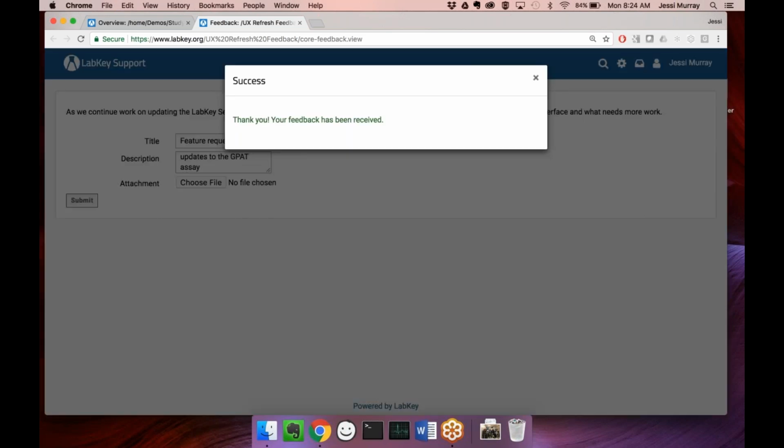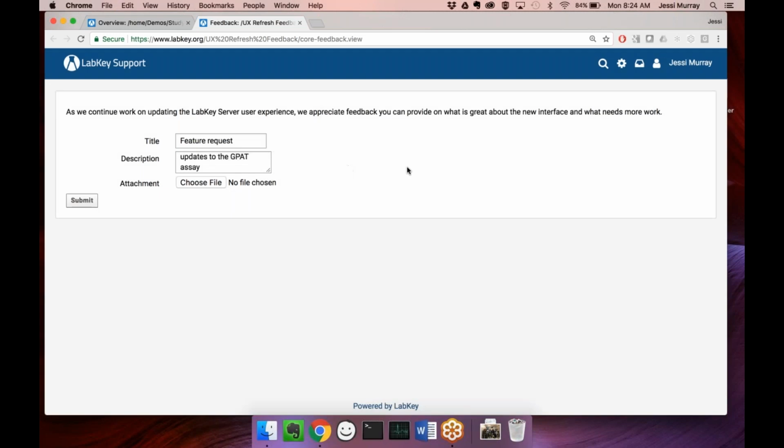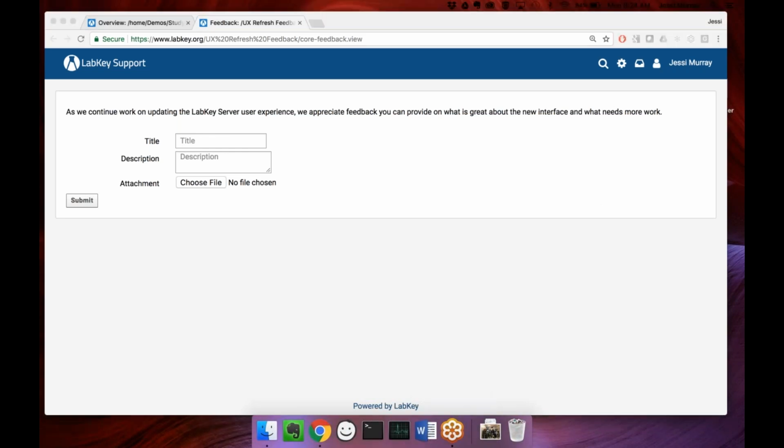And if you submit that, I will actually see it. I would say keep those related to the actual UI and UX, and try not to make that a catch-all. But we're also looking at, say, the forums and really things that are informed by you.